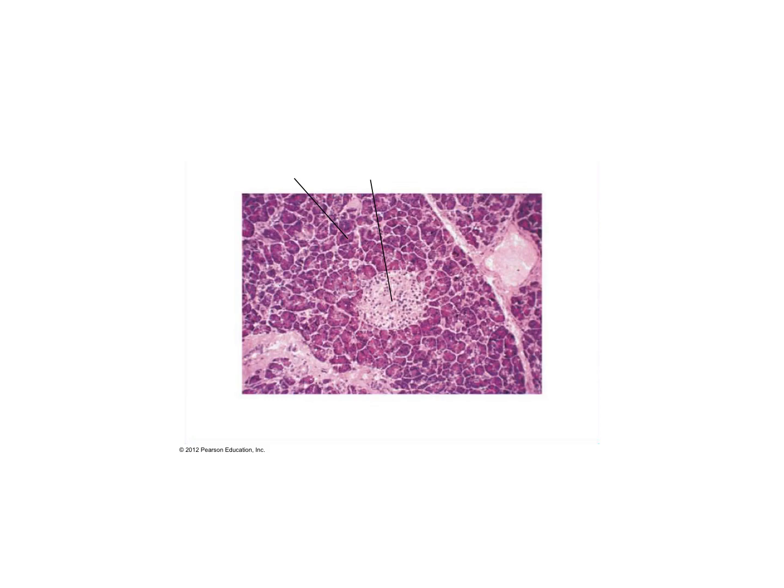Okay, yet again, a picture of the pancreas. This line is going all the way down to the center right here. This is a pancreatic islet. And then this line, again, is going to the acinar tissue. So we just had several slides in a row of the same thing, just different magnifications.